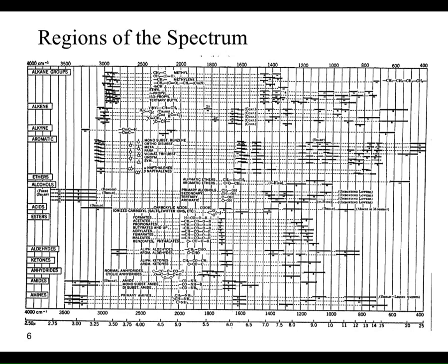but we're not going to use it. If we go ahead and take a look at this form of table, on the left-hand side they're identifying the different functional groups, and if we look at an alkane functional group, that's what we would expect to see. So they're referencing where the signal shows up, and if you look really carefully, that says S and S. Okay? So what they're referencing there is the strength of the signal. So they're saying we would expect for an alkane functional group 2 strong peaks in that range.